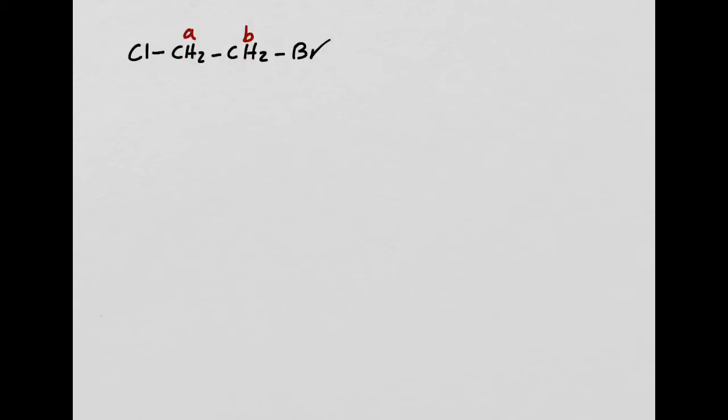Let's look at A. Again, the n plus 1 rule. You have to look at the adjacent carbon. Right here, there's no carbon over here. This carbon has how many? It has 2, right? So it would be 1 plus 2, which would be a triplet. Now, how about for this one? Exactly the same thing. So, this was for HA.